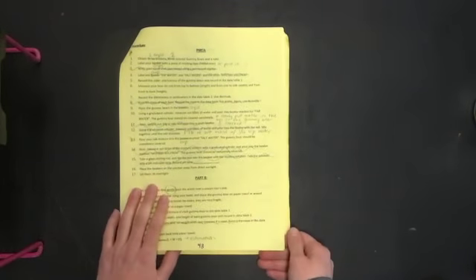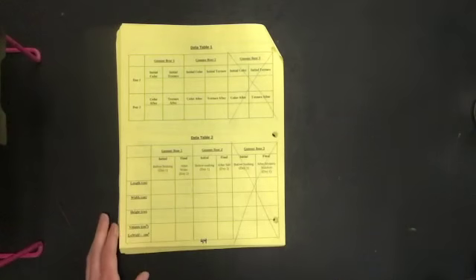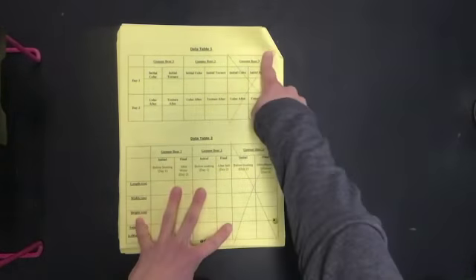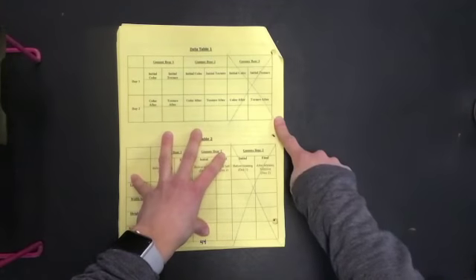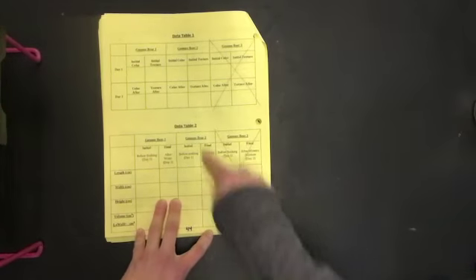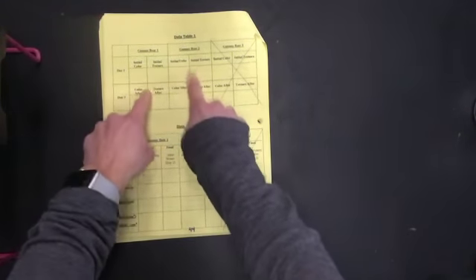Flip to page 43 again. Don't worry about all of this. I'm going to go through it step by step, so you won't have to worry about crossing any of that off either. If you flip to page 44, this is when you're going to take your pencil again and start crossing things off. Like I said, we're only doing 2 gummy bears and not 3. So we're going to cross off gummy bear number 3 section in data table 1. Same thing for data table 2, cross off gummy bear number 3. So really we're only focusing on 1 and 2 in both tables.